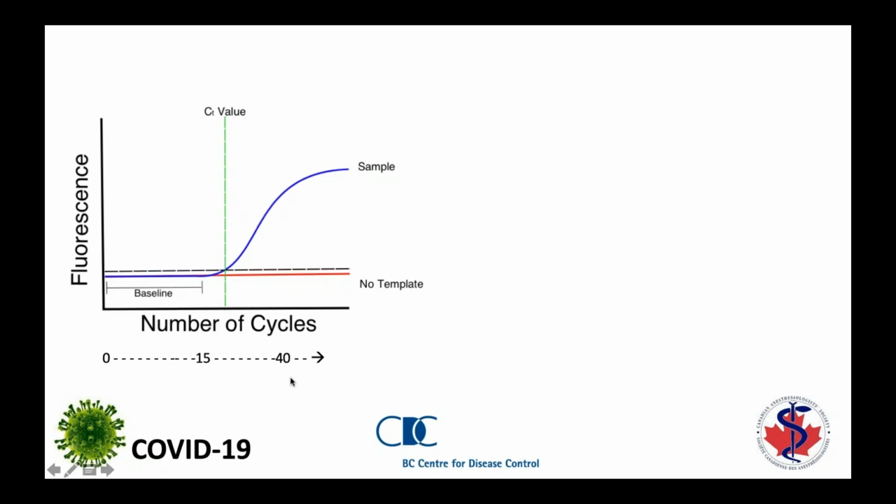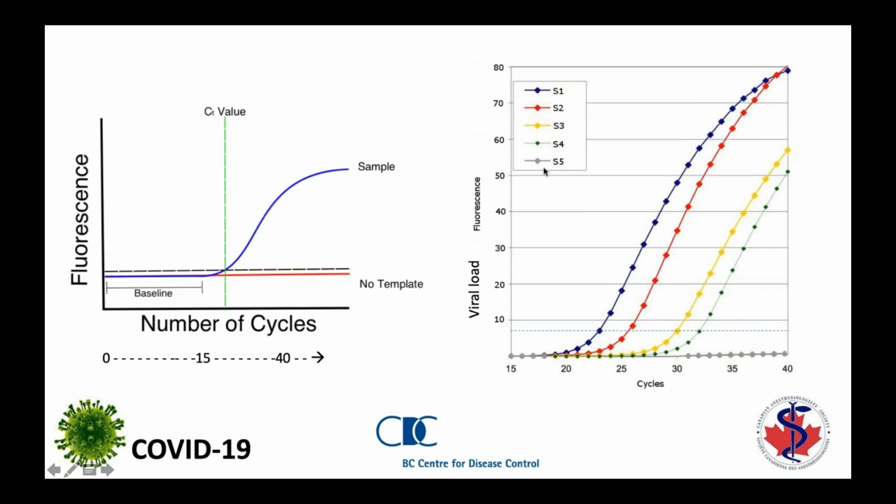Okay, a little bit of biochemistry and microbiology. This curve here is very important. Again, it shows the number of cycles on the x-axis, and the fluorescence, which is a correlation of viral load, on the y-axis. This curve shows the exponential increase of DNA during the PCR reaction. So for example, you have samples 1 to 5 generated on what a typical result would look like for us. You can see here that sample 1 intersects the cycle threshold at a CT of 23, sample 2 at 26, and sample 4 at a CT of 32.